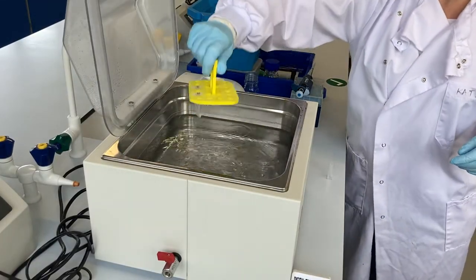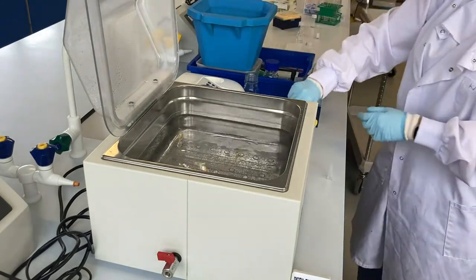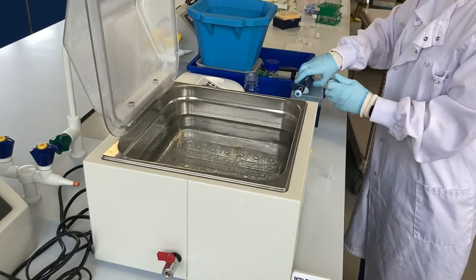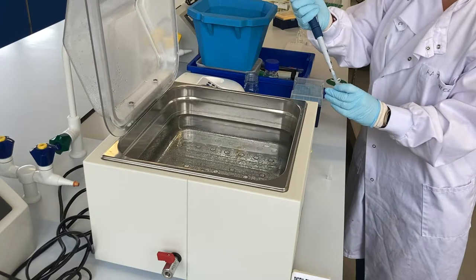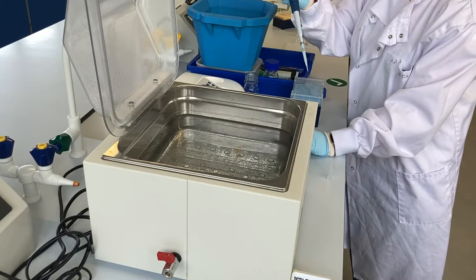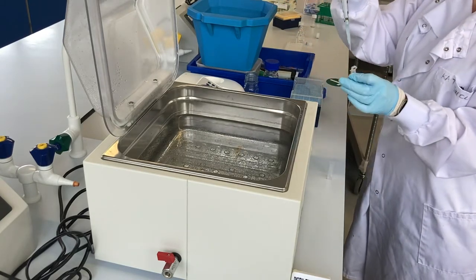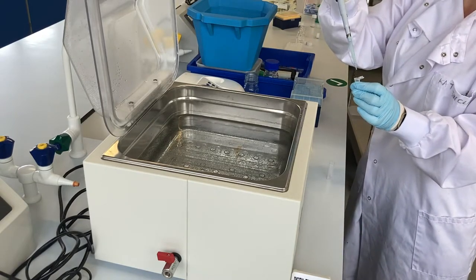The reagents are now brought up to the right temperature. As soon as I add the substrate into the enzyme, that's when we need to start the timer for the reaction.